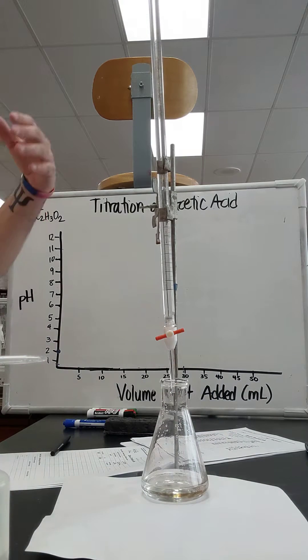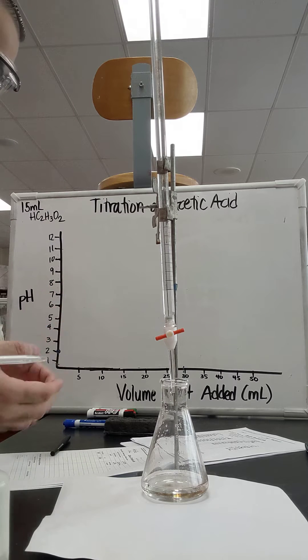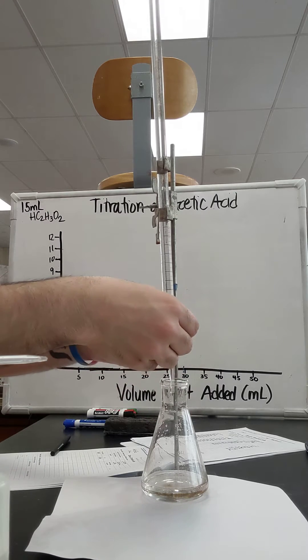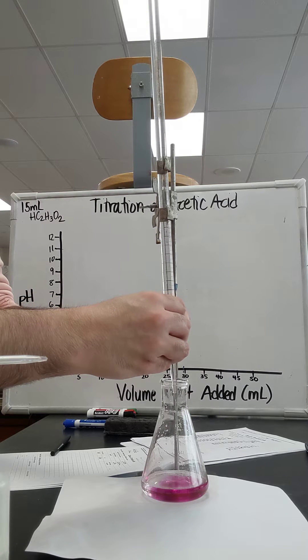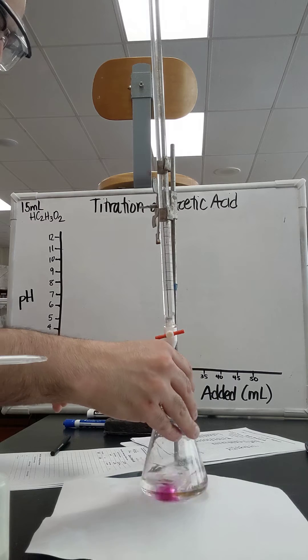And now I'm going to drop a couple milliliters of the sodium hydroxide and record changes in pH. I'm going to do two at a time. So I got 2 milliliters. Swirl, swirl, swirl.